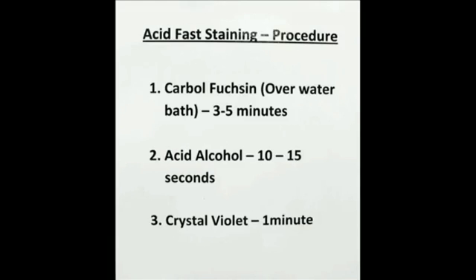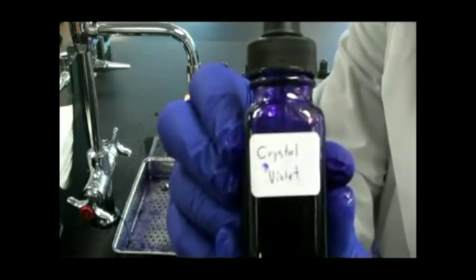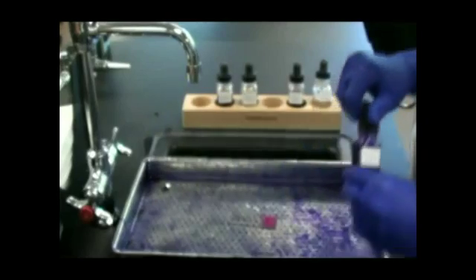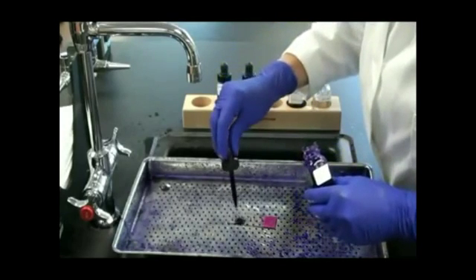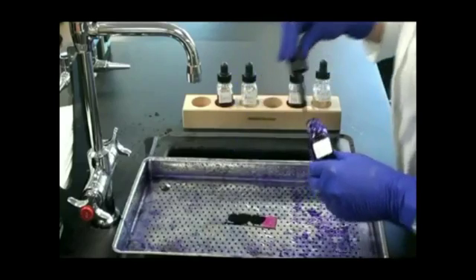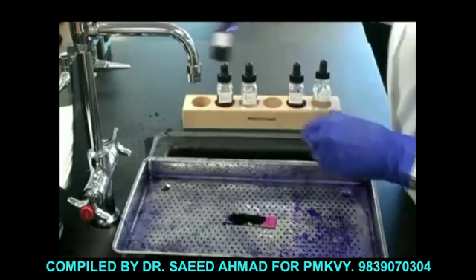Now I'm ready to apply the counter stain, crystal violet. This will stain the non-acid fast or non-waxy cells a dark purple color. I drip that crystal violet onto the slide, making sure that it covers all 3 of the bacterial smears, and I leave that on for 1 minute.